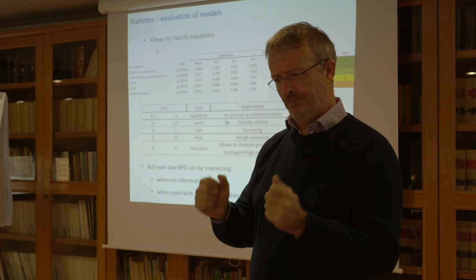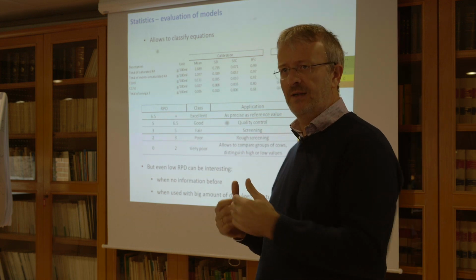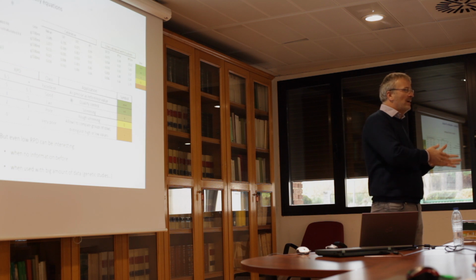The theory of the near infrared is different from the theory of the mid infrared. What I explained with the springs between the bonds and so on, it's for the mid infrared. For the near infrared, it's another idea. It's not exactly the same theory. That's why we need to use different techniques for the liquid and the near infrared and the solid.